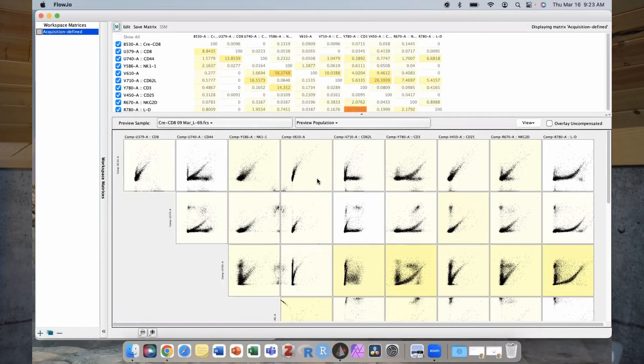Have you ever gone to analyze your data, you open up your comp matrix and it looks terrible? Comp problems everywhere. I've had a number of requests on the channel for how do I fix my compensation matrix. Today we're going to go through how to troubleshoot the issues with your compensation matrix, how to assess what those issues are, how you can fix them if possible, how to change your controls in the future so you can avoid them, and then at the very end I will show you how you can edit a compensation matrix.